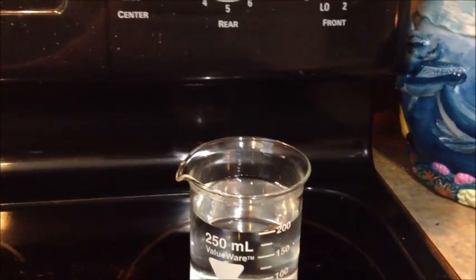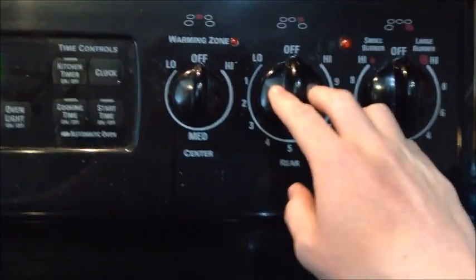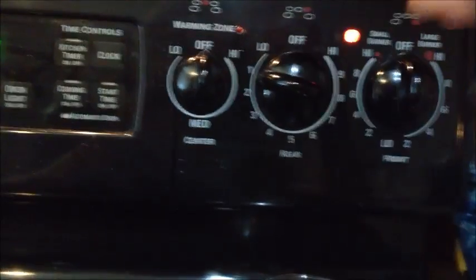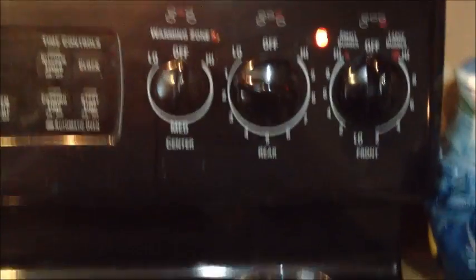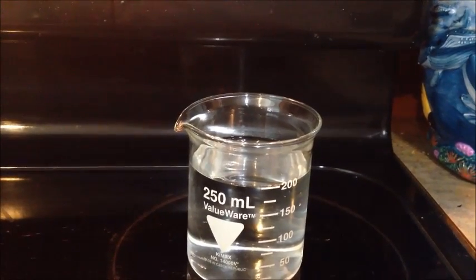Alright, so I've got my hydrogen peroxide placed on the burner. I'm going to turn the temperature down to low — it doesn't have to be high, just enough to bring it up just below boiling point. The boiling point for hydrogen peroxide is about 300 degrees Fahrenheit.